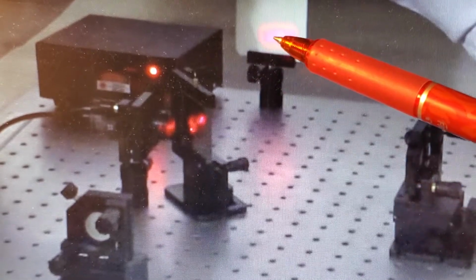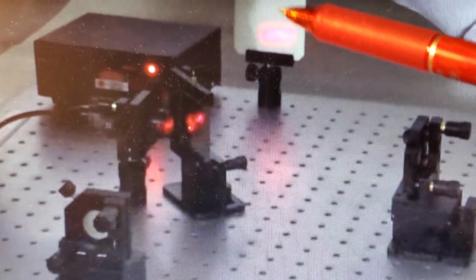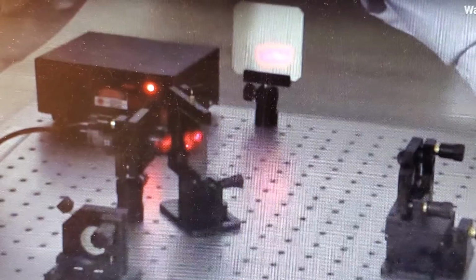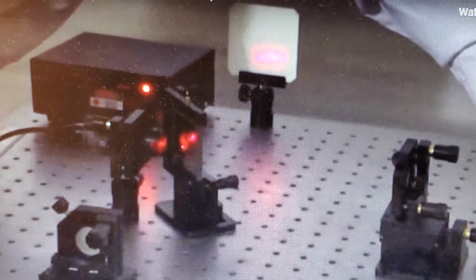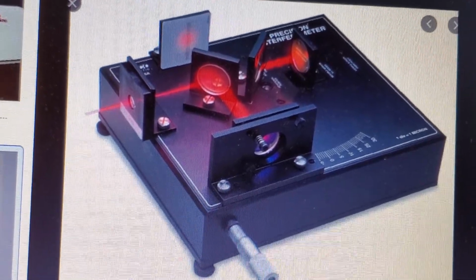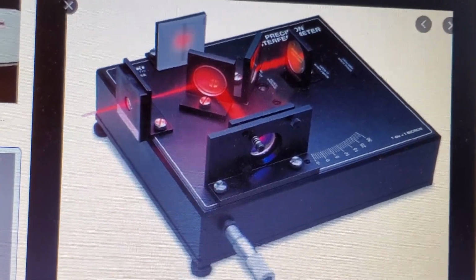And then this is not a detector, but for this simple experiment, they're trying to see the interference of the circular patterns on the screen as a detector. Such as this, when the lights are off in the room. Also, you can build your own customized system if you need to observe something of your own.